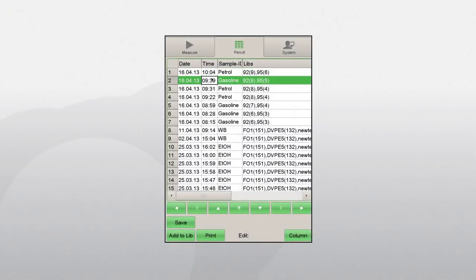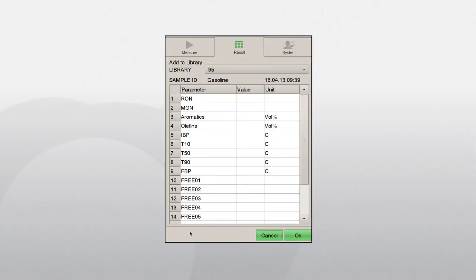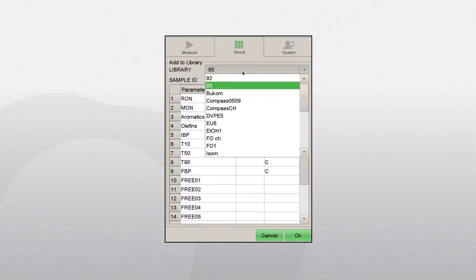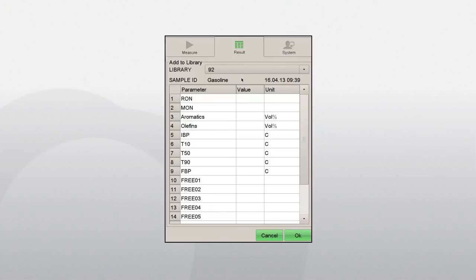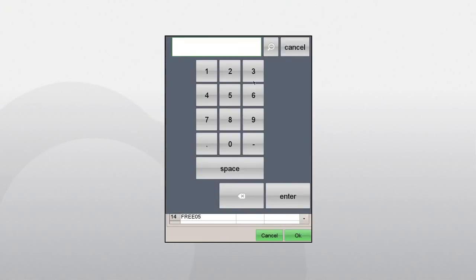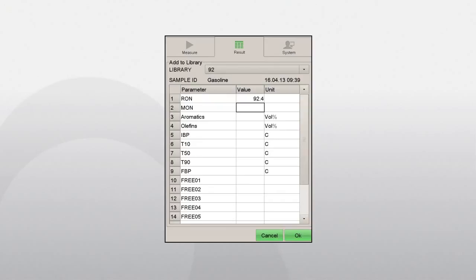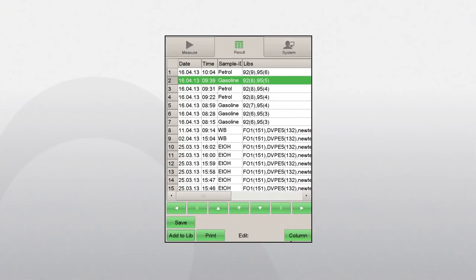Select the desired sample and press Add to Lib. Select the library to which the sample shall be added from the drop-down list in the first line. Then enter the values for all parameters of interest that are available as determined by the respective reference methods. Press OK to store and add this sample to the selected library.